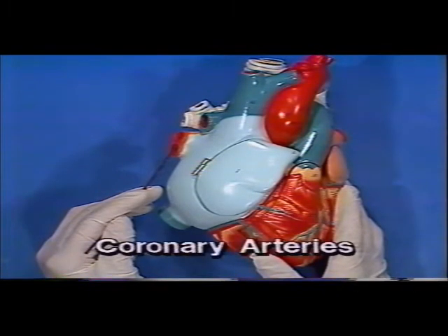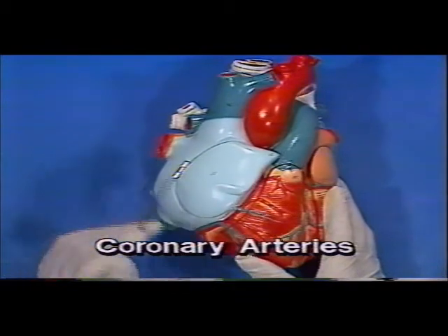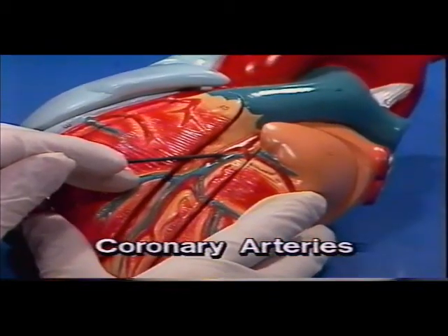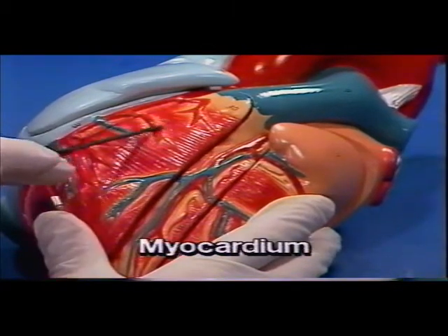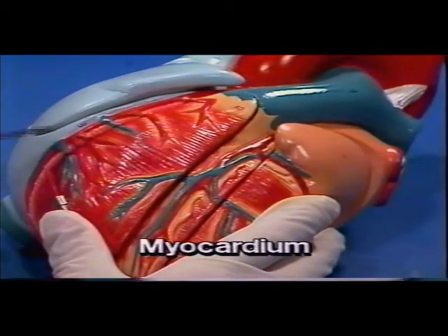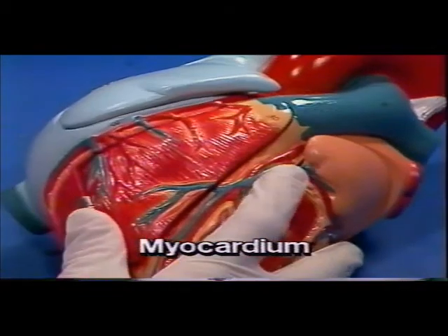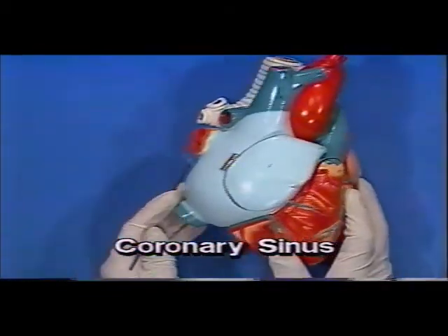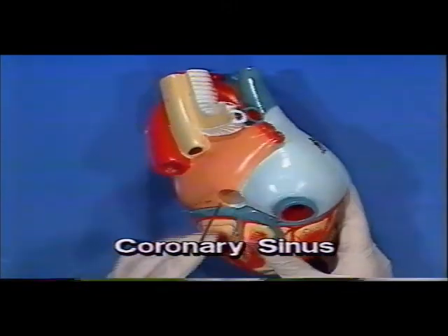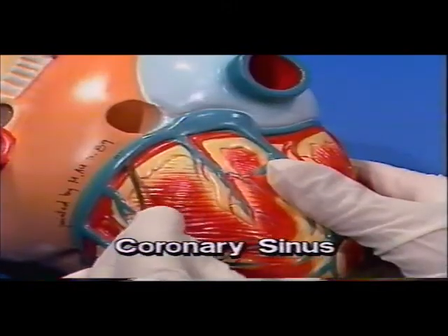Also, observe the right and left coronary arteries. These supply the heart muscle, or myocardium, with blood. The veins that drain the myocardium end in the large coronary sinus, which in turn empties into the right side of the heart.